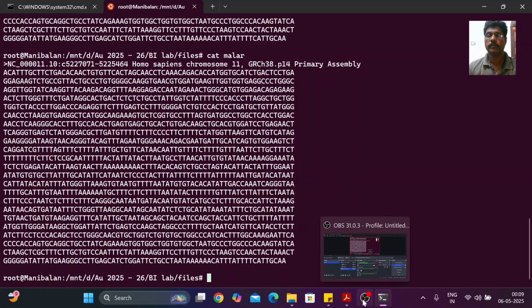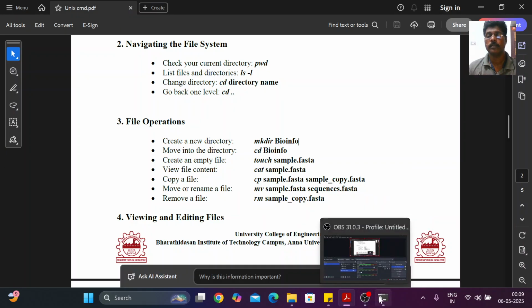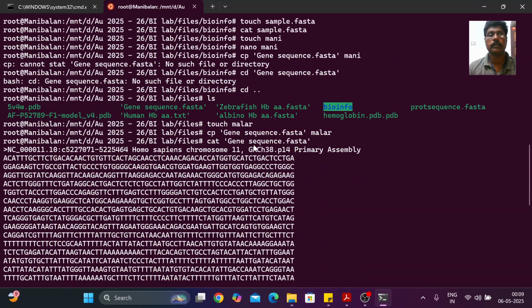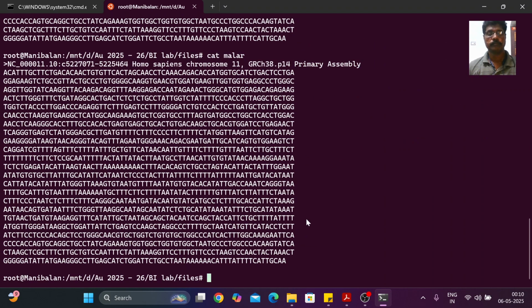And also if you want you can use the path, because in this we have different folders. In the folder, this is a directory, right? In this directory we have two files, but we can copy, we already tried copying this file into this folder, because we have to give permission and path also. Now we will try that. Okay, what is that? We will just try.